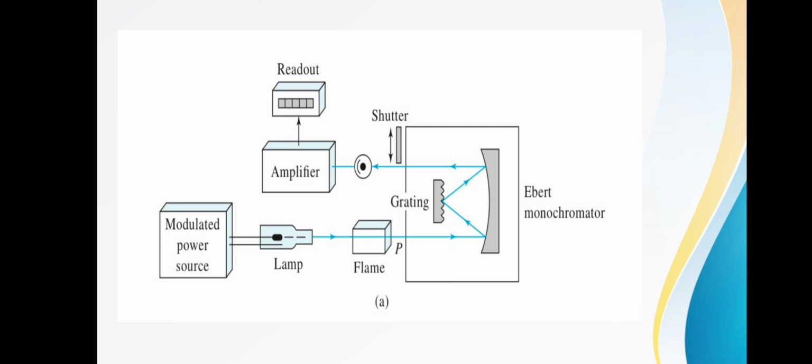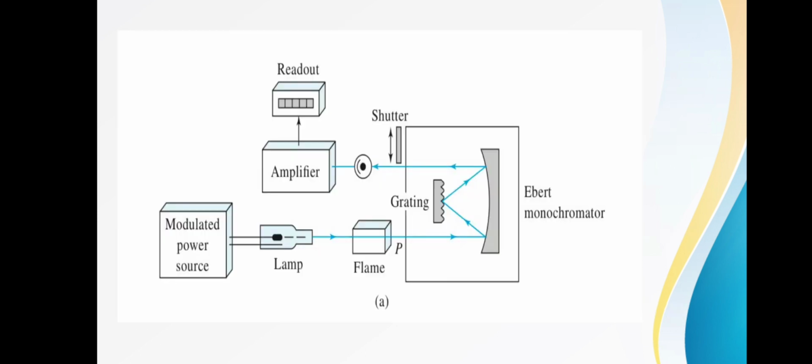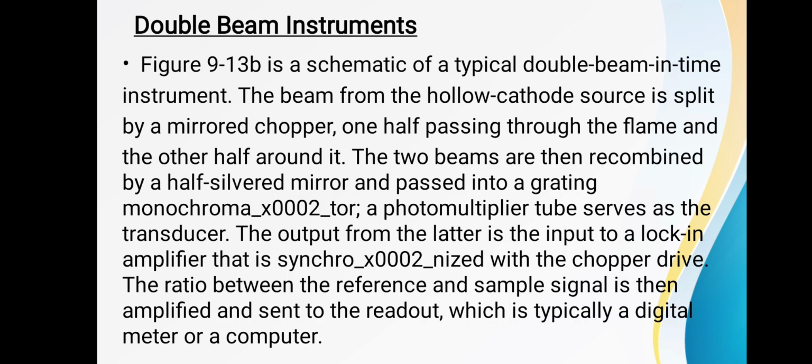Here you can see the diagram of single beam instruments. Double beam instruments. Figure is the schematic of a typical double beam instrument.